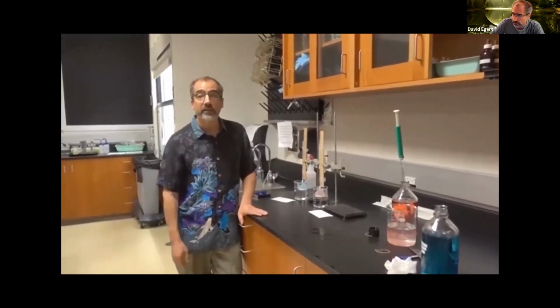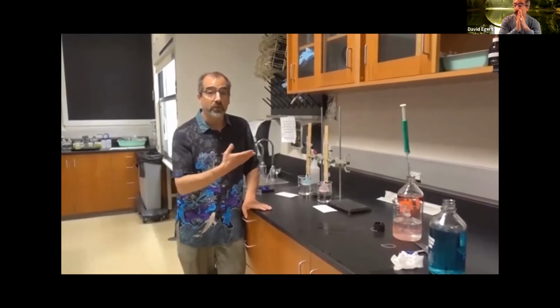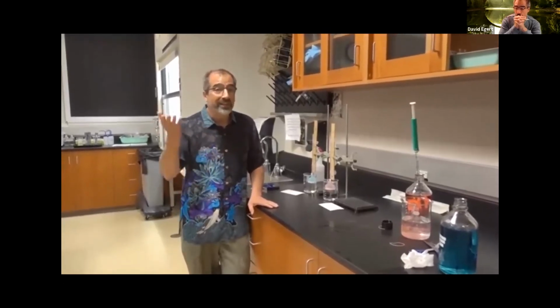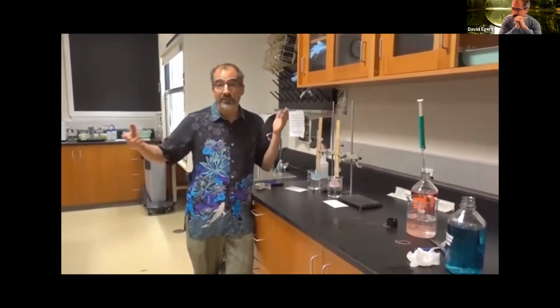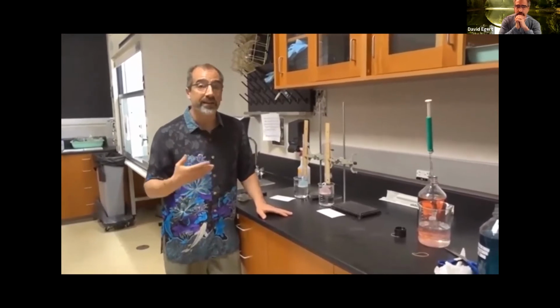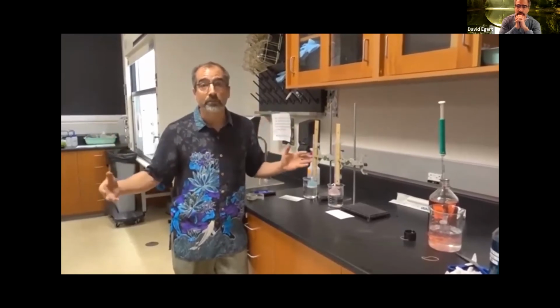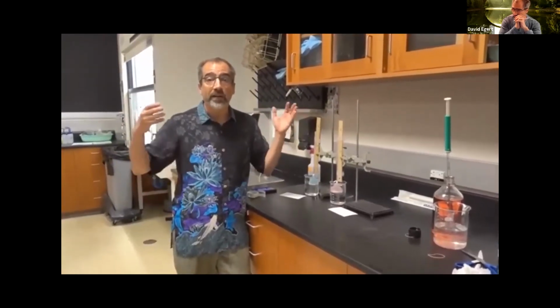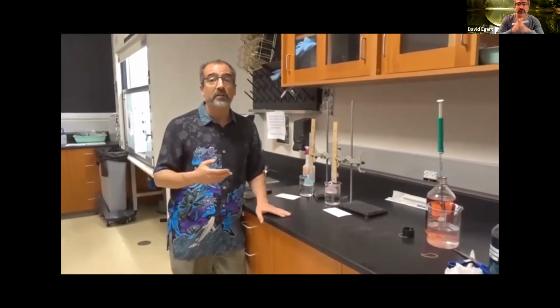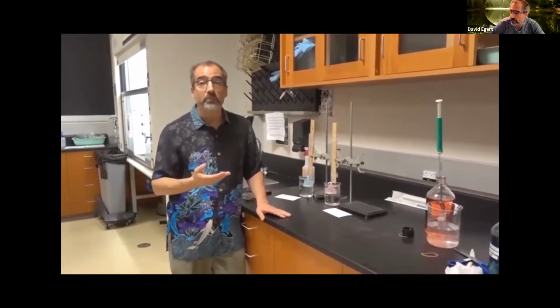That's the data you're going to see in the spreadsheet we supplied for you, from more than one group, because doing one experiment once doesn't tell you if it's a consistent result or just a one-off thing. But if you do the same experiment again and again and get similar results, or many people do the same experiment at the same time and all get similar results, then you can start believing your results are telling you something important.